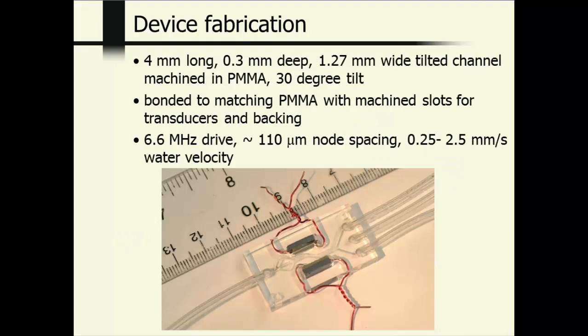The device fabrication that we will be talking about has a 4mm long channel. It is 0.3mm deep and 1.27mm wide. It is tilted at 30 degrees with respect to the transducers. It is bonded to a matching piece of plexiglass with machine slots for the transducers and the backing. And both of these pieces of plexiglass are fabricated by using a computer-controlled milling machine.